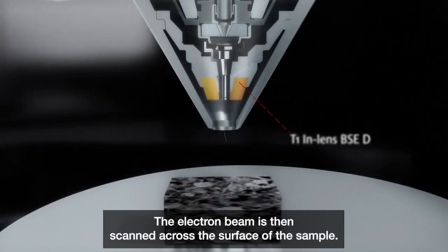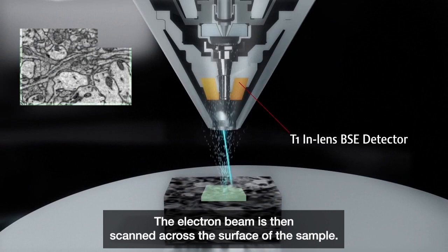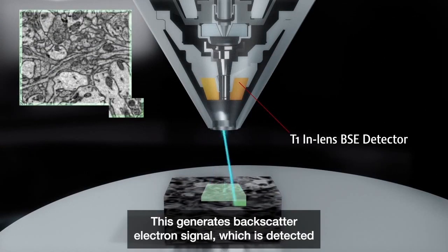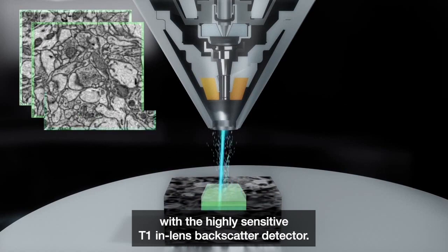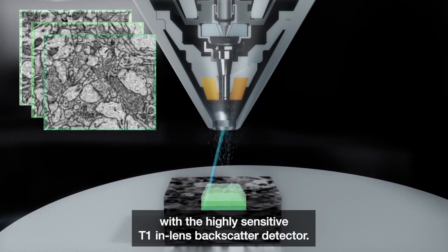The electron beam is then scanned across the surface of the sample. This generates backscatter electron signal which is detected with the highly sensitive T1 in-lens backscatter detector.